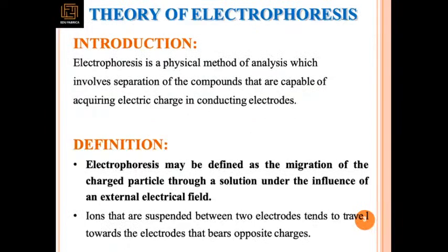Electrophoresis techniques. Basically it's a physical method of analyzing the separation of compounds that are capable of acquiring electric charge in conducting electrodes. So we have electrodes and we check the separation of the compounds that are capable of acquiring the electric charge, and based on that we separate our molecules in electrophoresis. Electrophoresis may be defined as the migration of charged particles through a solution under the influence of an external electric field. So under the external electric field, your particles could move in the solution and hence migration happens, and this is called electrophoresis.